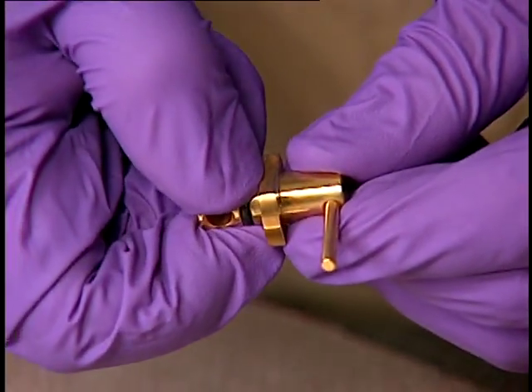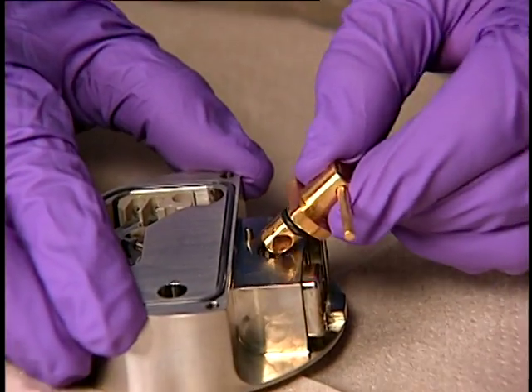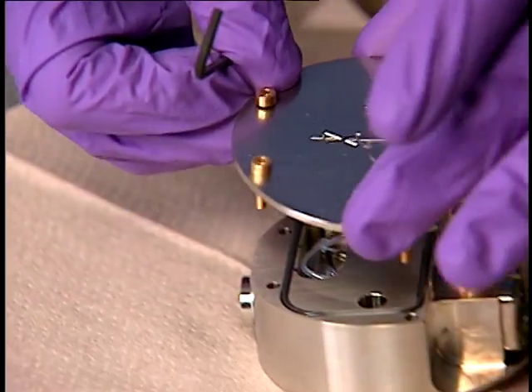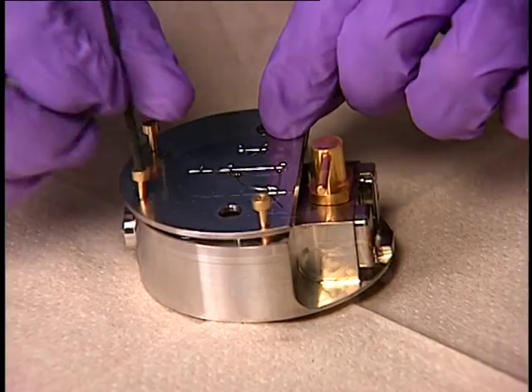Fit the new O-ring to the isolation valve. Then insert the isolation valve into the ion block assembly. Position the ion block cover plate on the ion block assembly and secure it with the four captive screws.